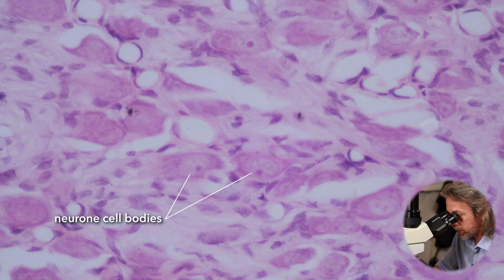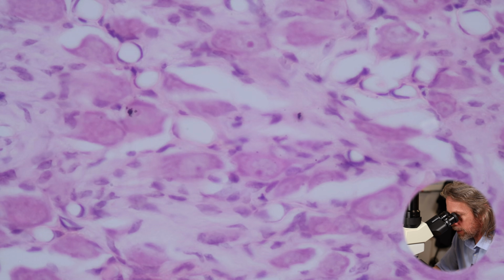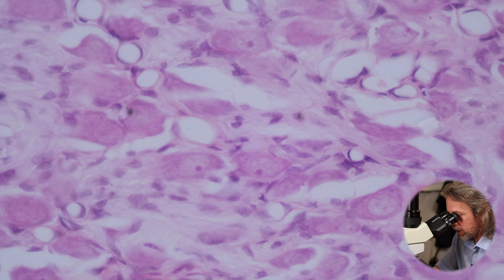So these are the big circles. Most of the little nuclei that seem unattached are support cells supporting the nervous system. But those big cells, you can see they've got a nucleolus inside them, a nucleus inside them. There's a circle, and they're inside the cell. I don't want to go to a higher power, do I? I think that's an oil lens.